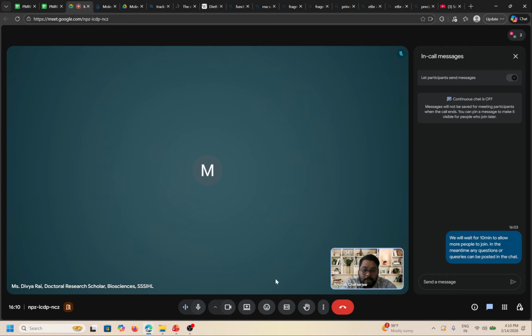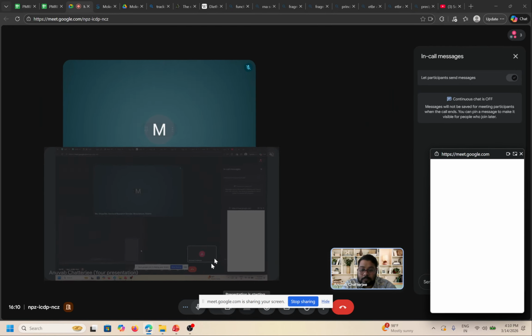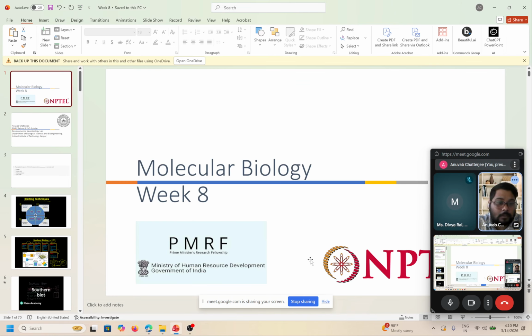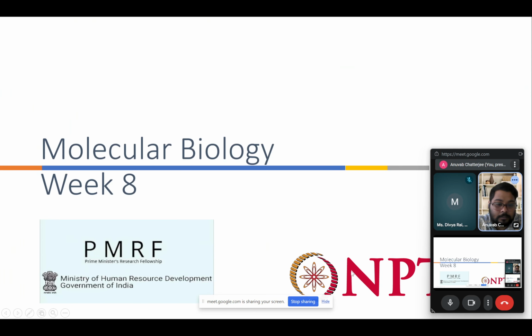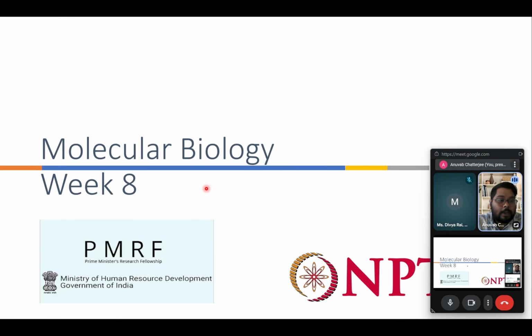Okay, let's get started for the day. Welcome everyone to the week 8 molecular biology lecture on the PMRF NPTEL session. So this week we are going to deal majorly with different molecular biology techniques such as northern and southern blotting as well as western blotting.